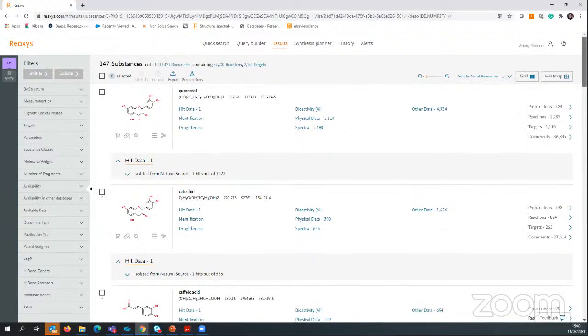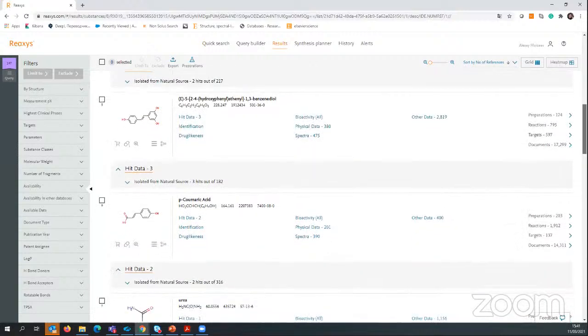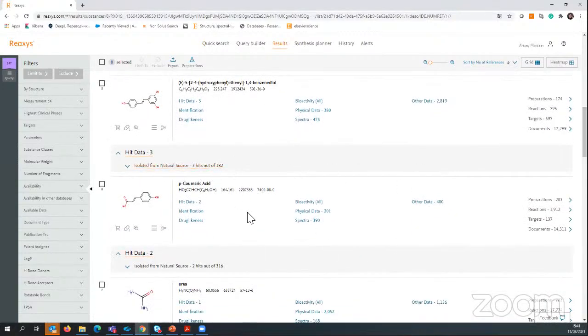Here you can get an understanding of how to make an analytical method to understand whether it is real natural wine or not natural wine, created from some chemical ingredients. It's really helpful. For example, as a sample, you can use some ingredients that are very difficult to add to the initial wine and develop analytical methods.